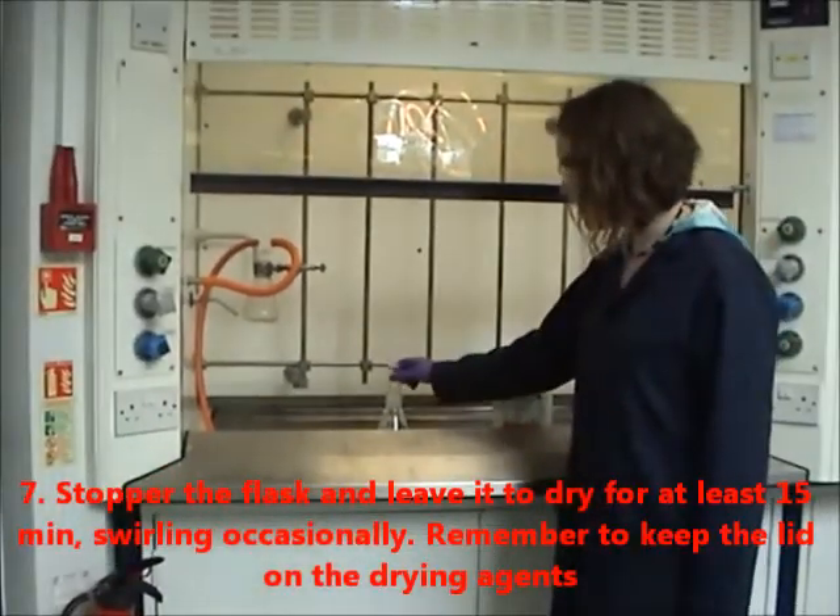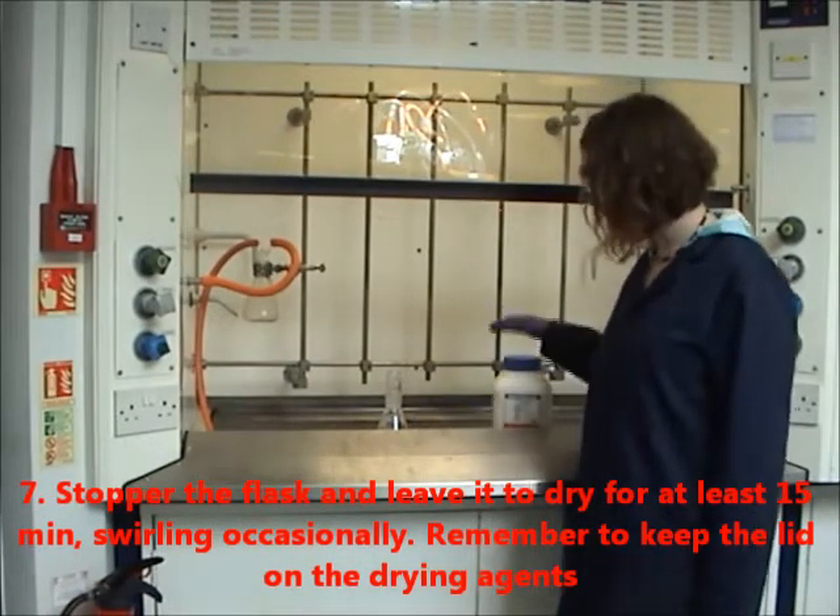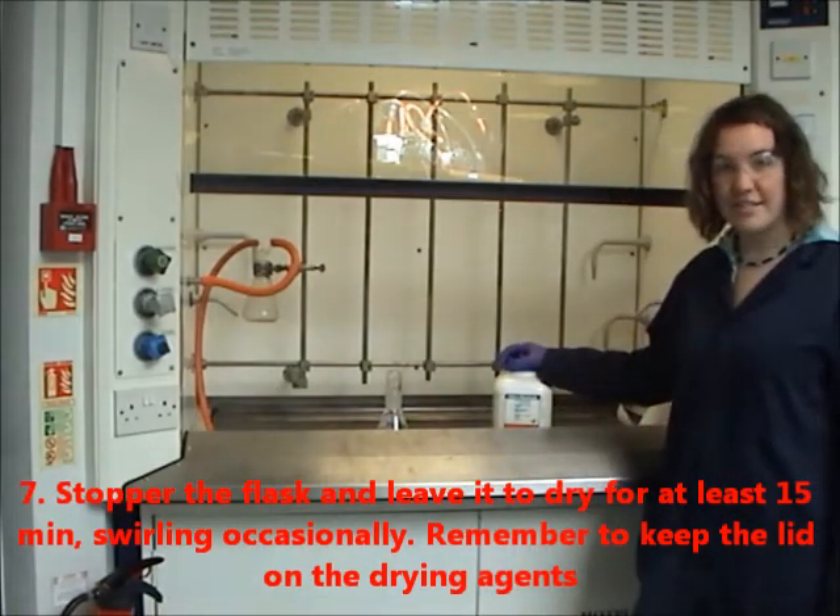Stopper the flask and leave it to dry for at least 15 minutes, swirling occasionally. Remember to keep the lid on the drying agents.